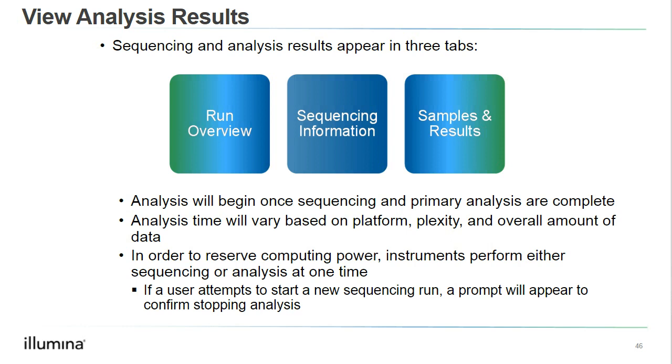So if you have an analysis in progress and you start a new run, you'll be asked if you want to stop the first analysis. You can select yes and start your run. At that point, you would need to go back and restart your analysis once the run is complete, and that will restart from the beginning. It will not pick up where it left off. Analysis time will vary based on the workflow you've selected, the complexity, and the overall amount of data.